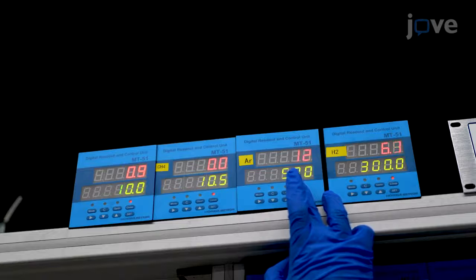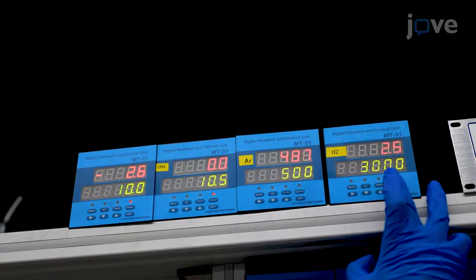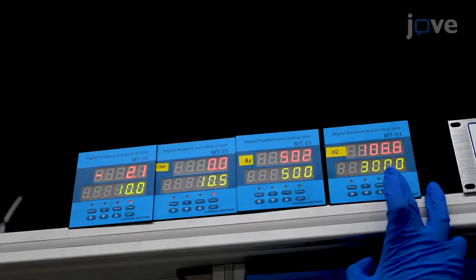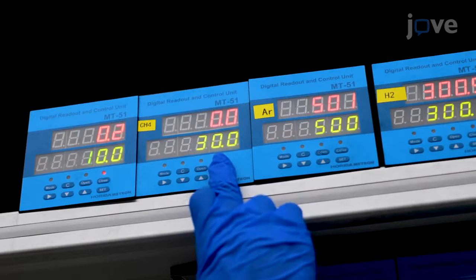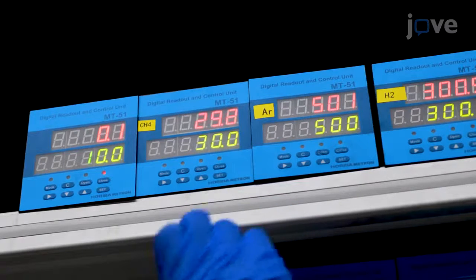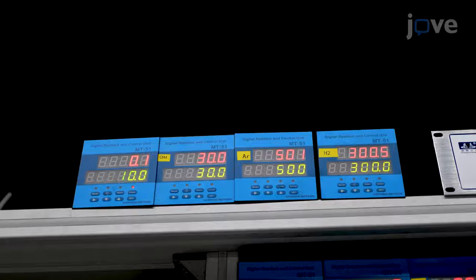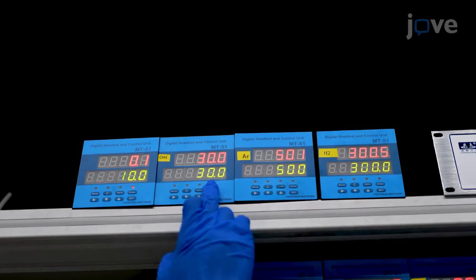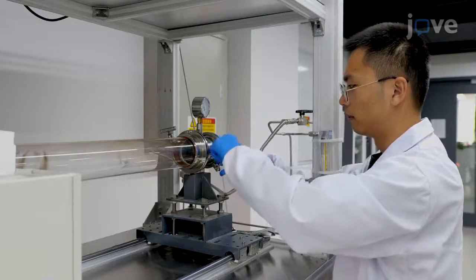Stabilize the temperature for 10 minutes under 500 standard cubic centimeters per minute of argon and 300 standard cubic centimeters per minute of hydrogen. Then, introduce 30 standard cubic centimeters per minute of methane into the reaction chamber for the growth of the graphene on the NPSS for 3 hours. At the end of the growth reaction, switch off the methane and allow the NPSS to cool naturally.